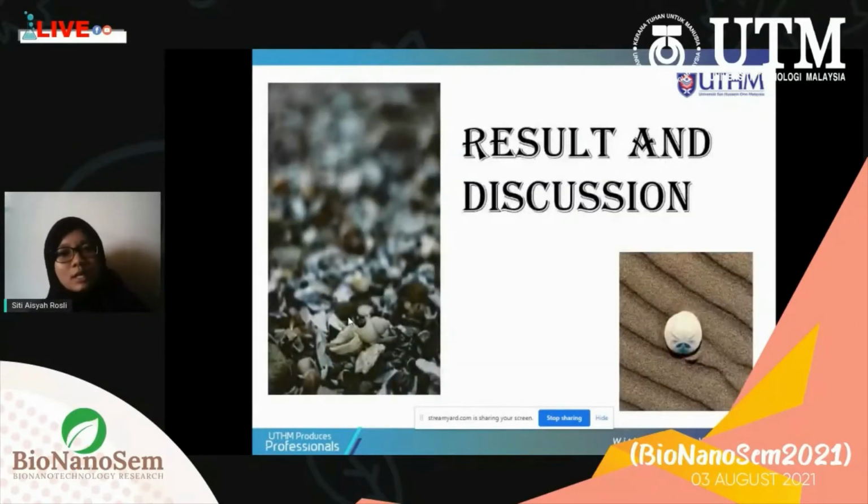In this result and discussion, we will discuss the mass loss during the heat treatment process because we weighed the samples before and after heat treatment. Then we discuss the calcium content in our waste oyster shell, which will be compared to our previous study.